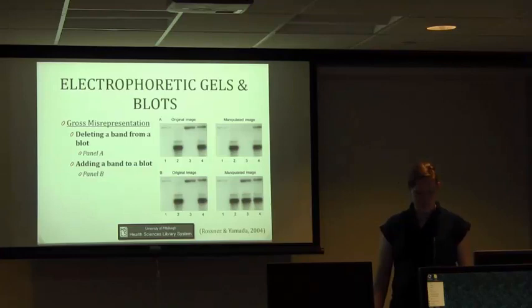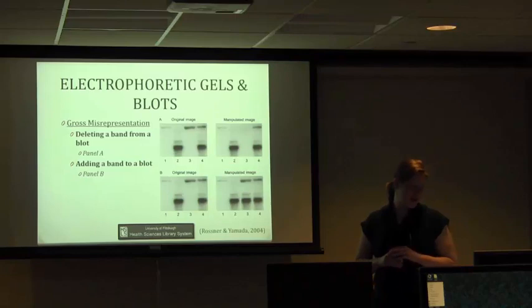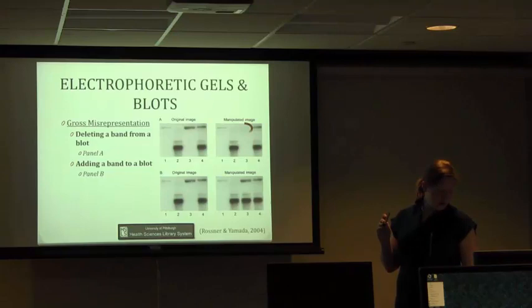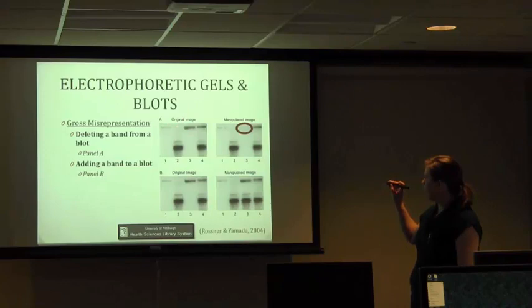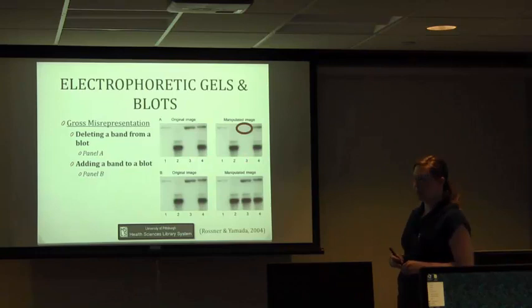Let's go into some specific examples that were found in this Rossner paper about misrepresentation of data. The author did say that all of these were taken from, well, the images aren't from original cases, but the thought behind them is. These were things they actually encountered as an editor of Journal of Cell Biology. First, they have a subcategory of gross misrepresentation. This is something we hope nobody is doing because this is what they would consider more intentional. The first one is deleting a band. In this figure from the paper, you can see that up here in panel A, the original image had a band here, but they deleted it here.